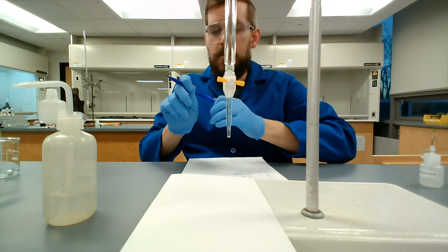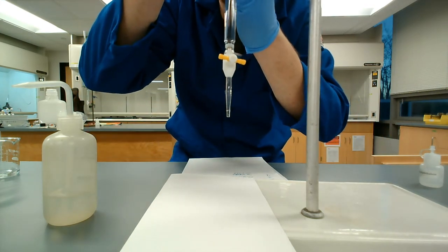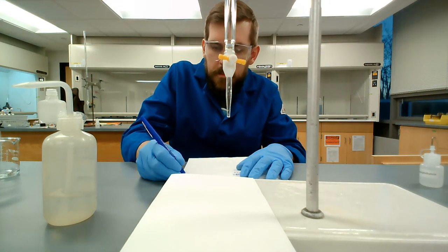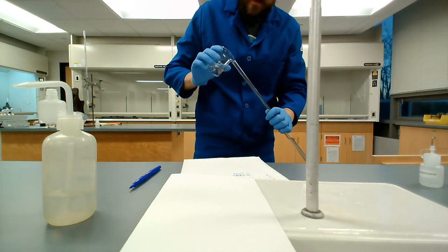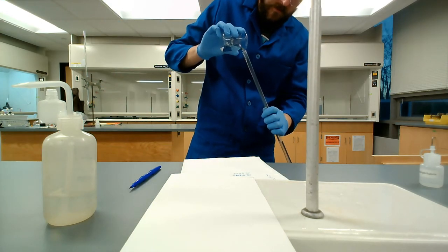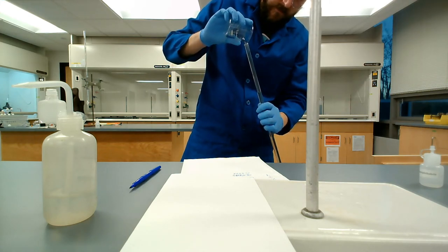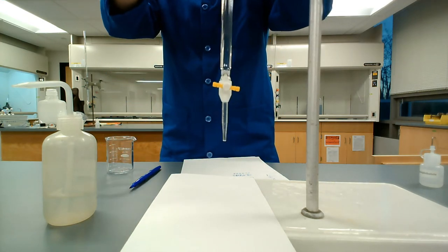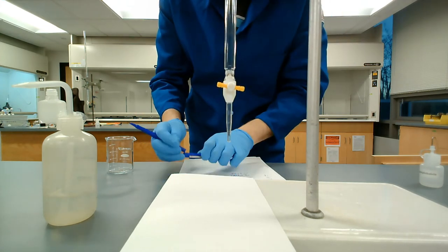I'm pretty sure the third titration is the one that I screwed up. I got a little distracted and too involved making sure things were showing up on the video, but it does demonstrate a good sort of lesson in titrations. Notice I'm always taking the burette off the clamp, off the stand to fill it up. This is just a sort of safety thing of mine.